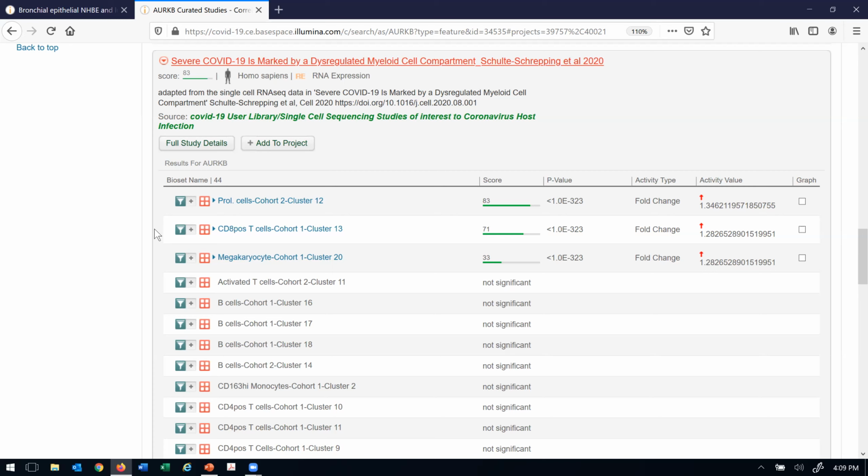Please contact us to get you registered to join in the search to better understand the mechanisms and potential interventions to this devastating pandemic. If you have ongoing research, then you can quickly assess and validate in silico which directions your research heads and publish with more confidence.